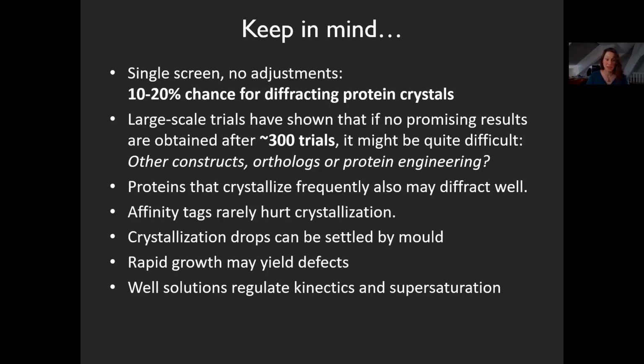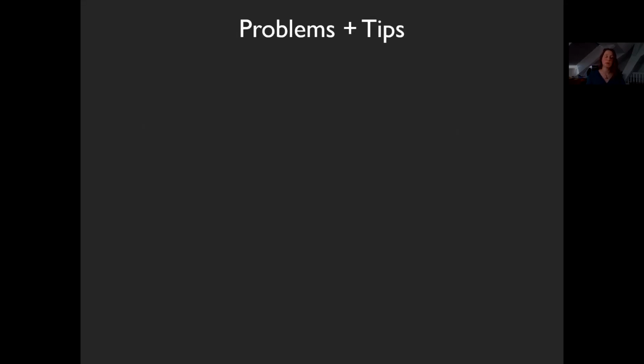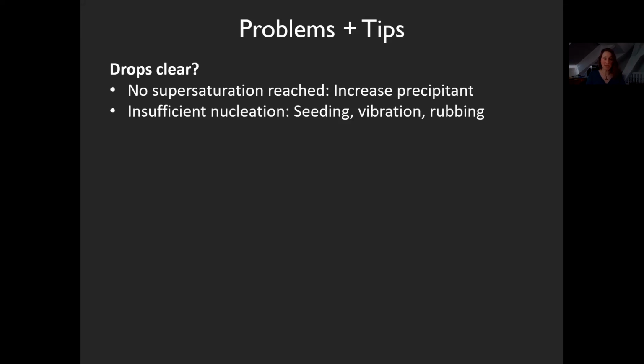Well solutions regulate kinetics and supersaturations, so you can add salt to the well solution if you think your drop needs to lose some more water. Crystallization cocktail is usually given as before mixing. So if there's a pH in that, that means stock solution pH, not pH in your well. This is very important when you want to reproduce someone else's crystallization conditions, and it's not always said.